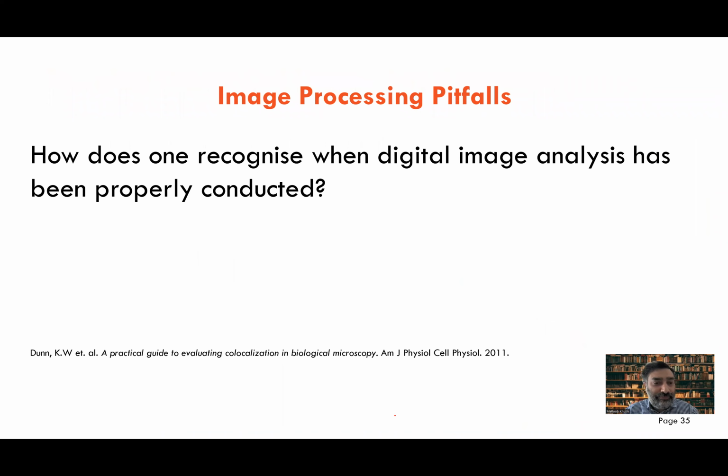Okay, so how do you know that you have done good image processing? People are going to give you images: here are my images for one treatment, here are my images for the second treatment, here are my images for the third treatment. And they expect you to show the difference. All studies tend to produce positive results. All studies want to show that their drug, their process does have an effect and it does solve the problem.